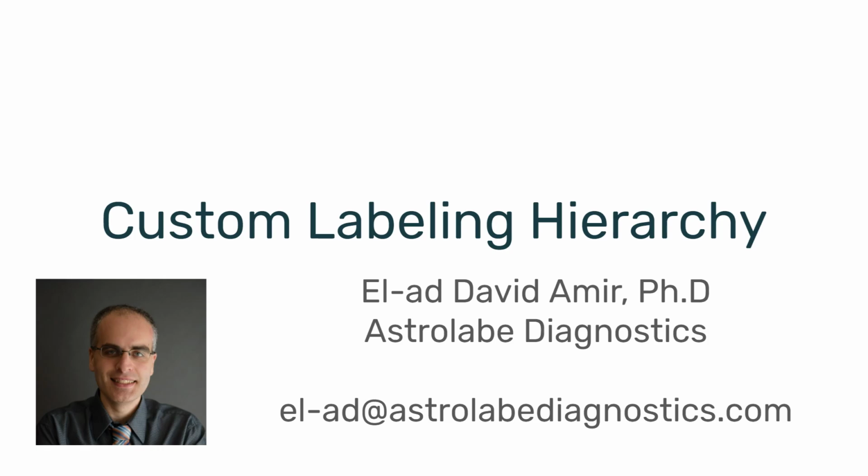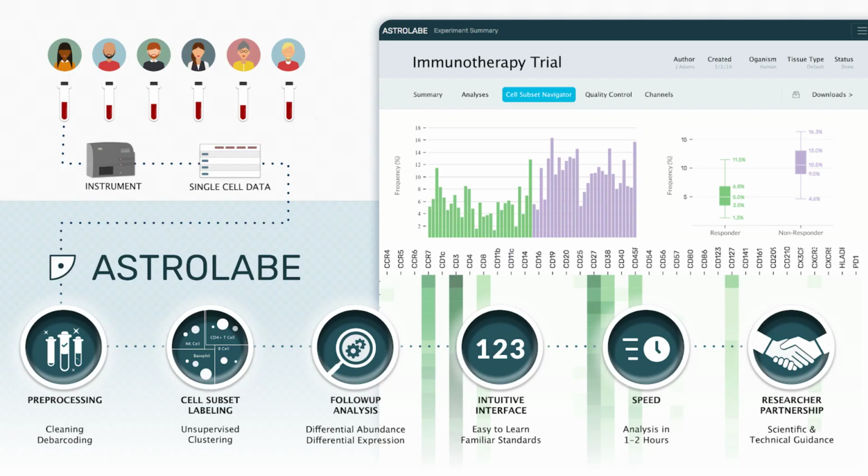Today I would like to discuss Astrolabe's capability to customize a labeling hierarchy to your panel. Astrolabe is a fully automated platform for the analysis of flow and mass cytometry data, and one of the steps of the pipeline is labeling the different cell subsets, a process that is typically done manually using traditional gating and which Astrolabe standardizes and automates.